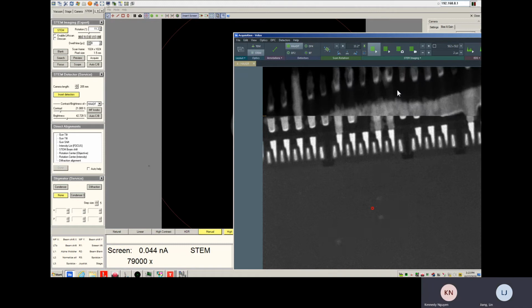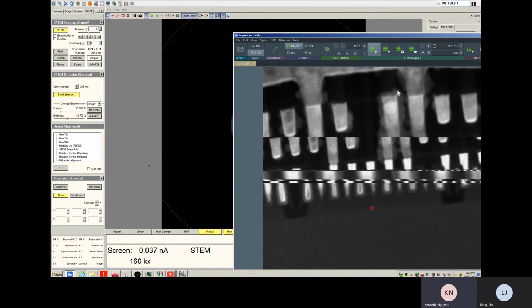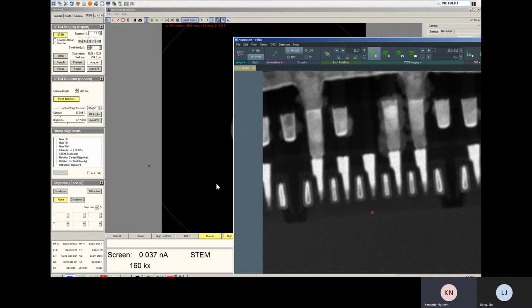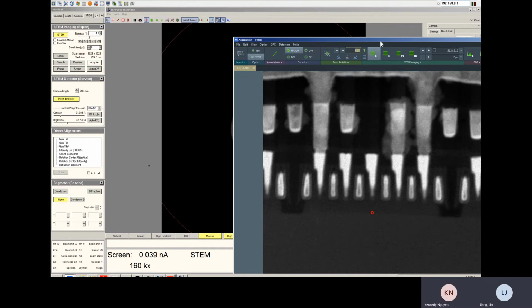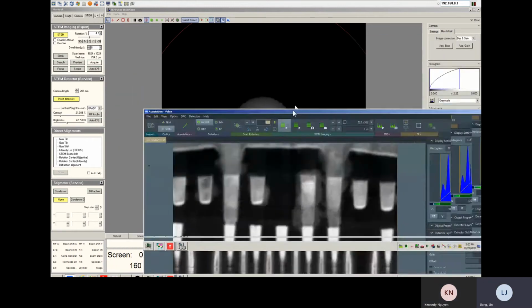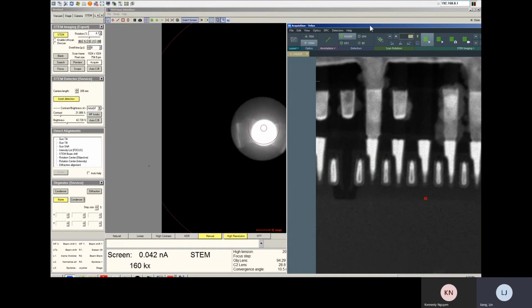So if you're looking at nanoparticles and you can't find the diffraction pattern right away, how do you do this then? For nanoparticles, either you can just look at multiple particles. It depends on how lucky you are.